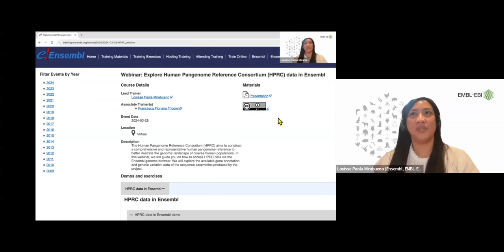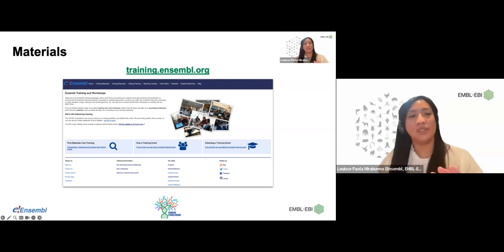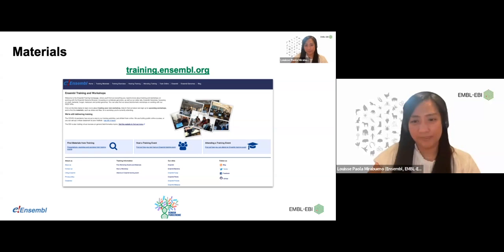All right, so let's switch back to my presentation. All of these materials are going to be available to you indefinitely. So even maybe in one week's time, if you've forgotten how to retrieve, for example, variation, you can always come back to that website and go through the walkthrough in your own time.